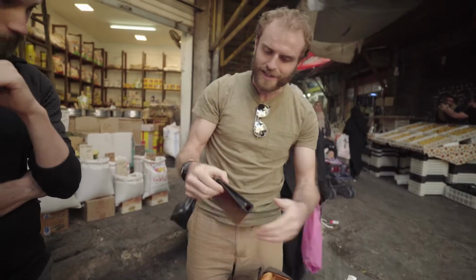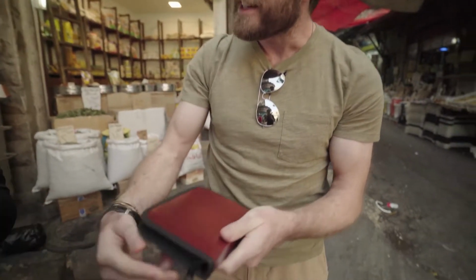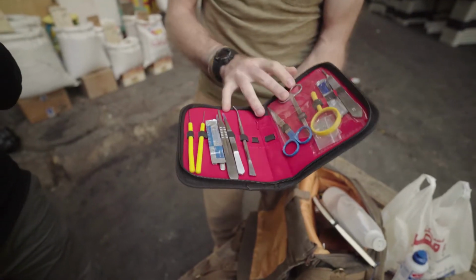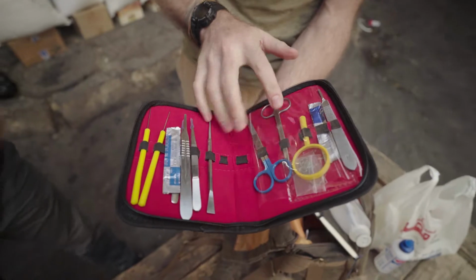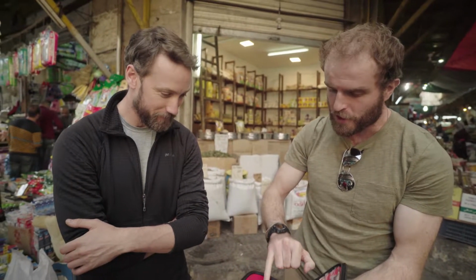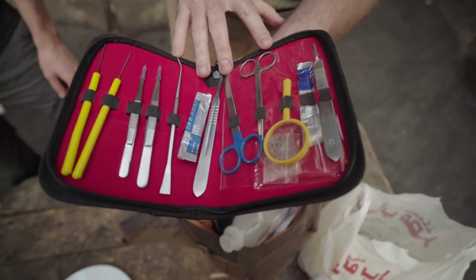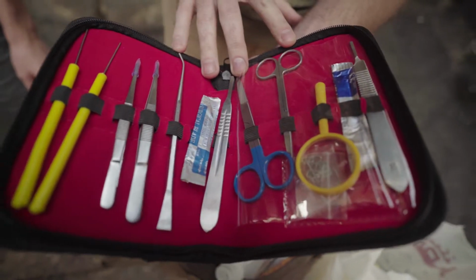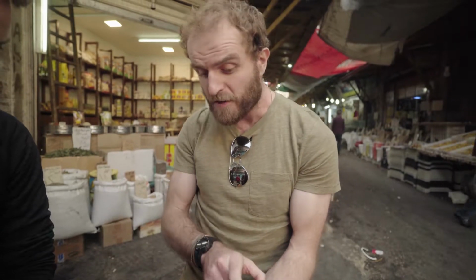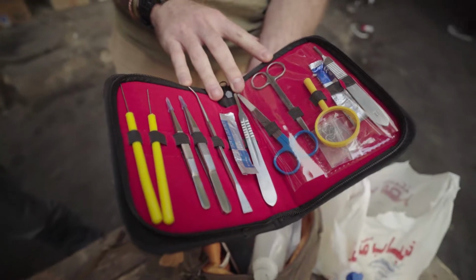The next piece of equipment, any good biologist, any good anatomist worth their salt, has a dissection kit. So this is our dissection kit. We've got forceps. We've got a fine forceps. We've got a coarse forceps. We've got two sharp pointed probes. They're for looking at internal anatomy a bit more closely. They're for holding bits back when you're looking inside. In addition, we've got some very, very sharp and very rugged scissors. They can go through bone of a certain dimension.